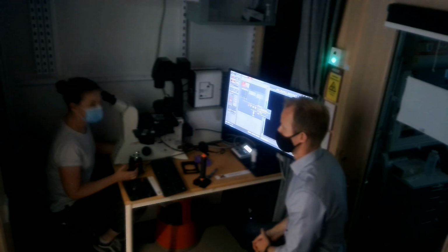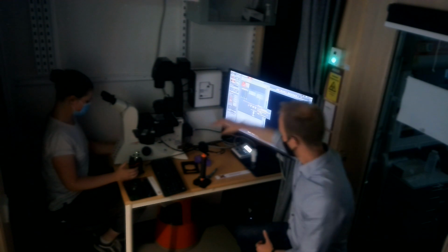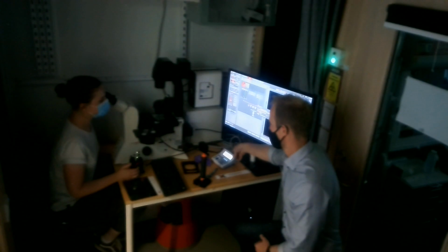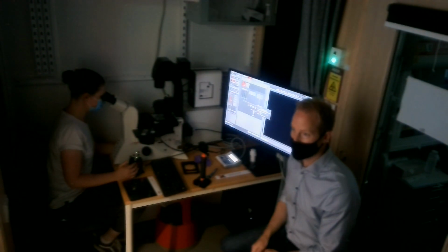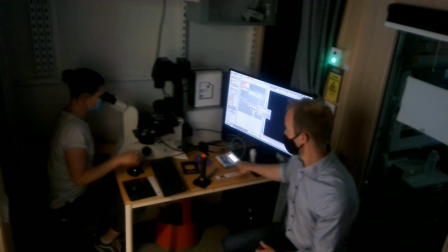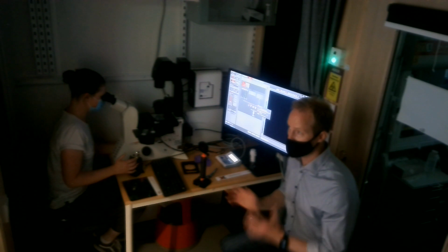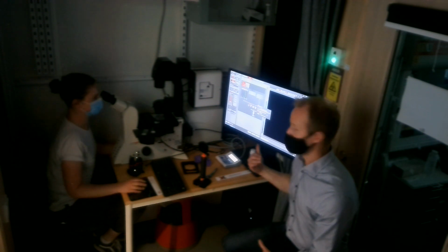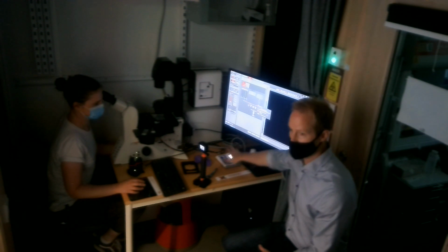You could also use just the tools on the microscope, and this little guy, we haven't gone through this, and I was planning on not talking so much about it. This one is the control for the QLED. If you want to use this completely manual, not start the software, you can do that too, and this one would then control the QLED, so you can pick which wavelength you want to have. But as soon as the software is on, then this one goes into a remote, and it's not in function.